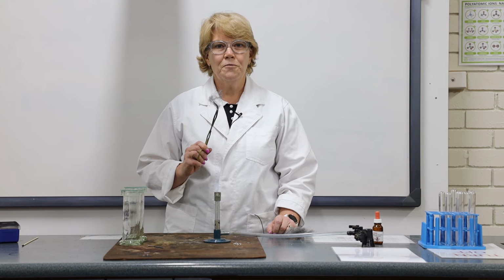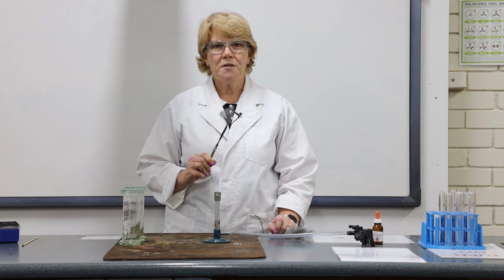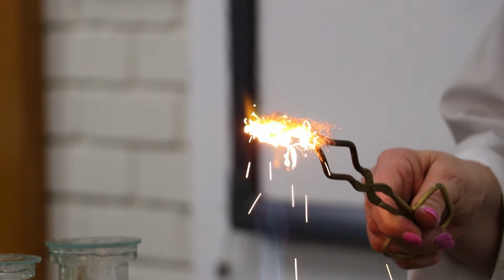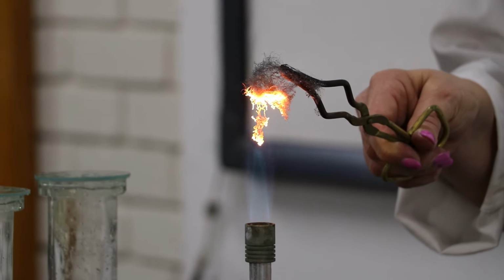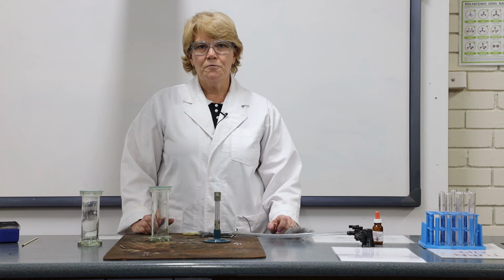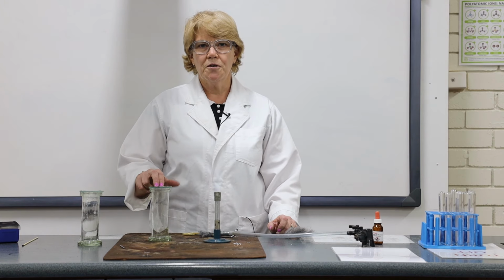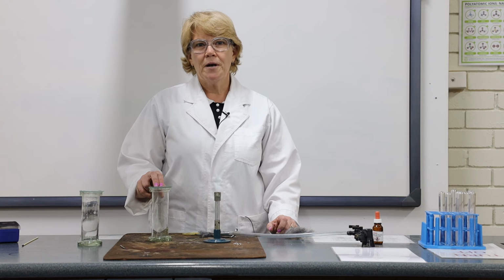I have some steel wool. This has really high surface area. Let's see how that burns in the Bunsen burner flame. We're now going to see how steel wool burns in pure oxygen. Well, really it's just air enriched with some extra oxygen, but it should be enough to really support the combustion.